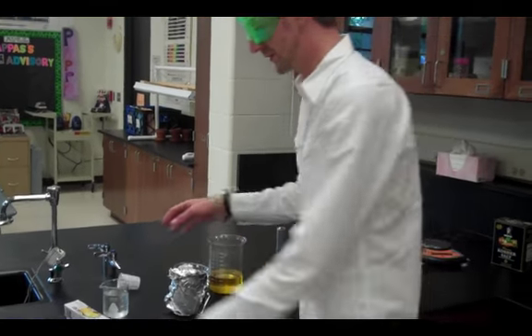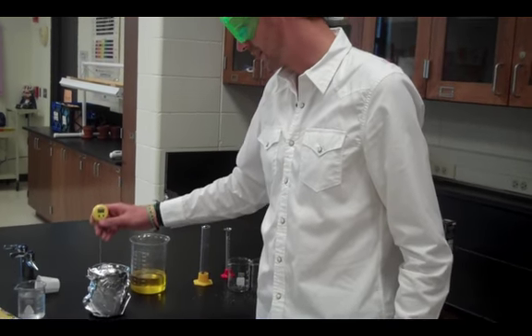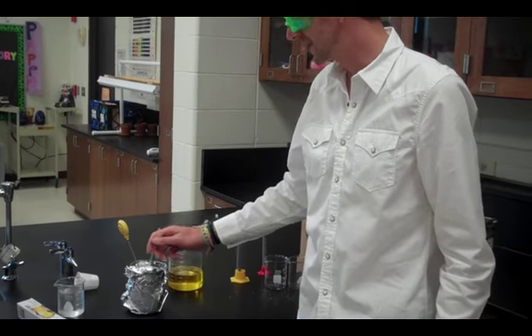Then what you're going to do is take your thermometer, put it in your ice bath, and you're going to stir until it is negative 10 degrees Celsius.